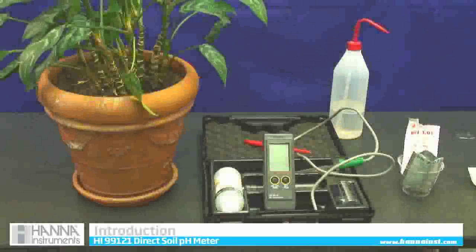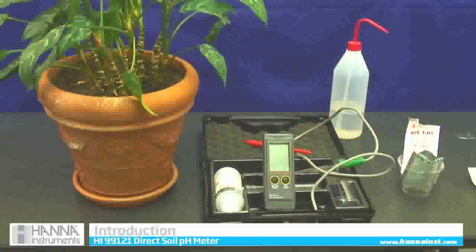This is a Hanna's Instruments HI-99-121 direct stick soil pH meter. It is very accurate — I had it tested by the University of New Hampshire, and the reading you receive on this is the same reading as if you get from your soil lab.